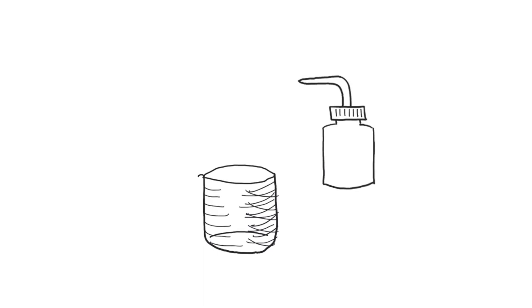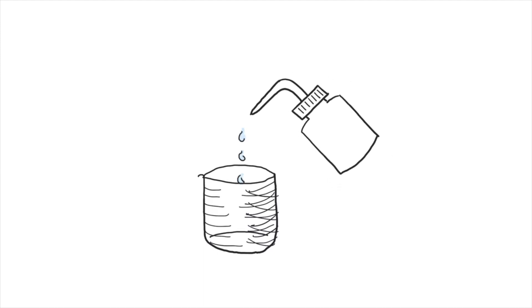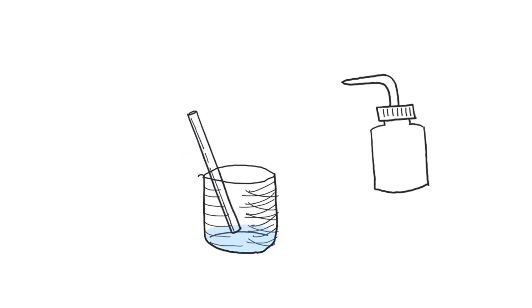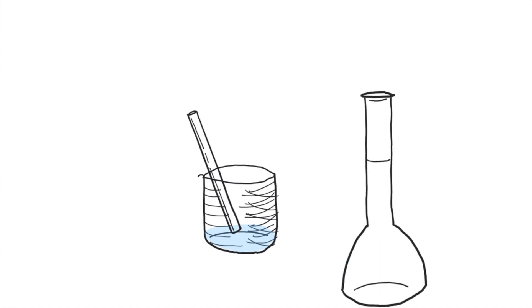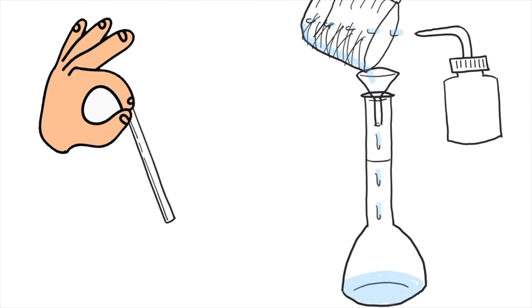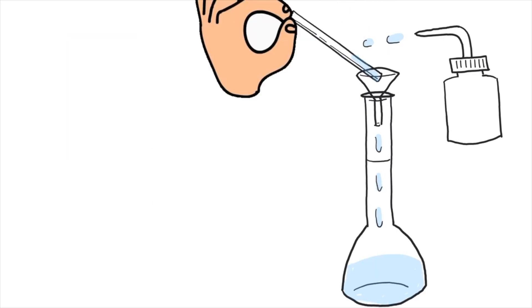Use a plastic wash bottle to add a little distilled water to the beaker, and use a glass rod to stir the mixture to completely dissolve the sodium carbonate. Keep the glass rod in the beaker at all times. Transfer the solution to a clean volumetric flask — it doesn't need to be dry as more water will be added. Use a small glass funnel for the transfer, and rinse both the beaker and the glass stirring rod with the wash bottle so all solution goes into the flask.